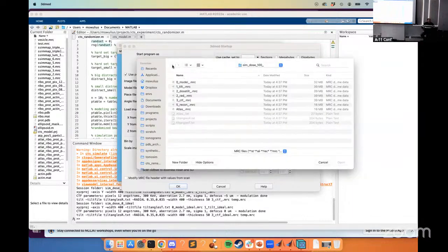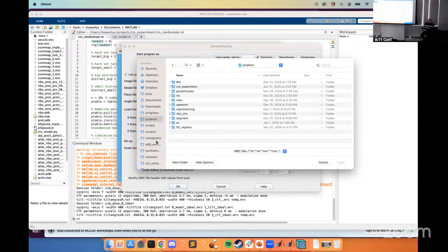I think this isn't going to work actually, because since you put the phase plates into the simulator, I have to induce a phase shift to get the kind of perfect contrast that I need. So I have to do it from the command line. I have not updated our graphical interface to integrate his newest addition of a phase plate. So I think when I open this it's going to look bad. If not, I'll just go to the command line and show you what I do.